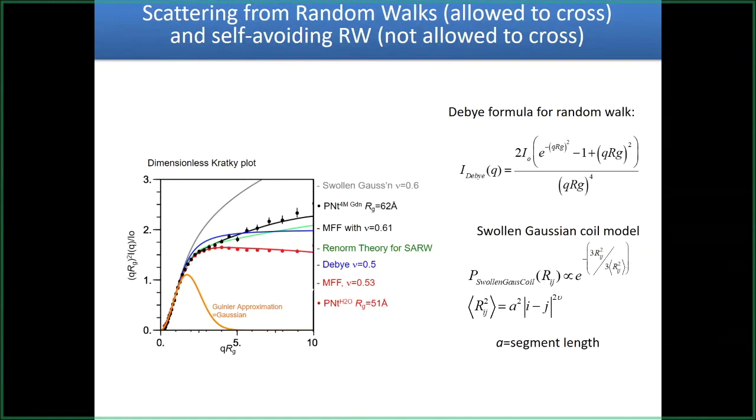So I look in both the normal scattering space, log-log, and I look in the renormalized space. And when you're fitting data towards the end, you'll see this become apparent. You'll say, how far out do I want to fit it? And ideally, it's going to be robust. With the program we use, it'll fit out to here, and you can see if it extrapolates well, and then you're pretty confident things are working.